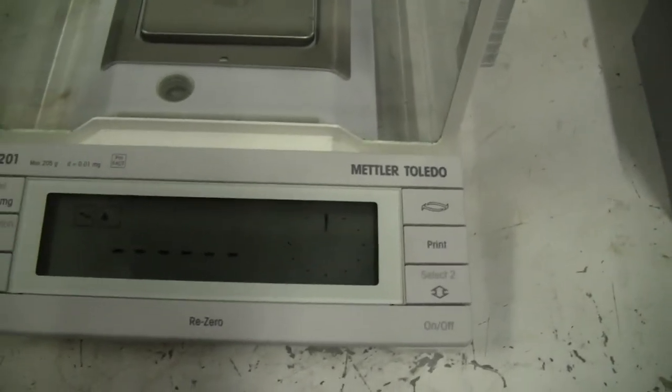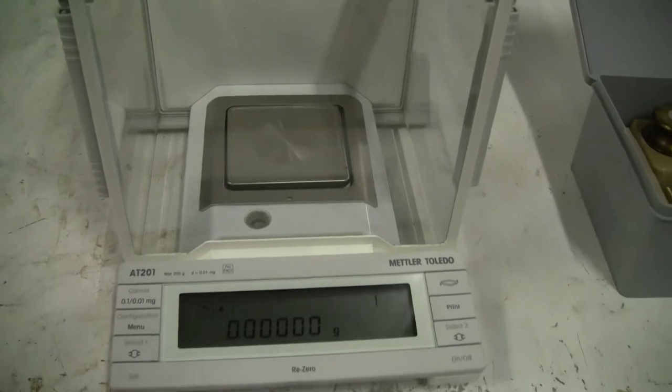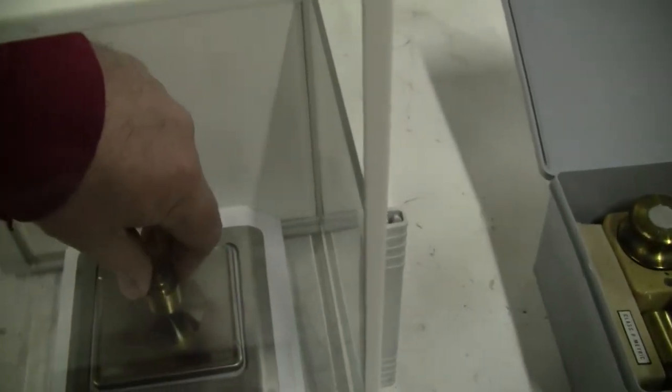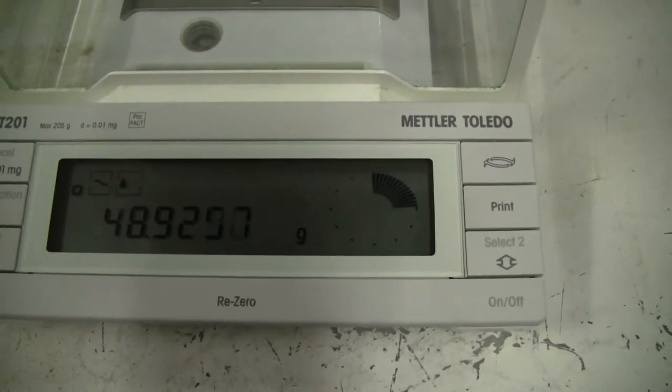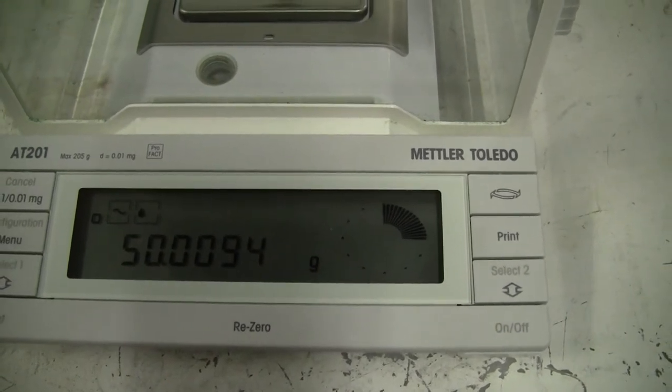Re-zero it out, take a look at it. Let's put a 50 gram weight on there. That's your 50 gram weight.